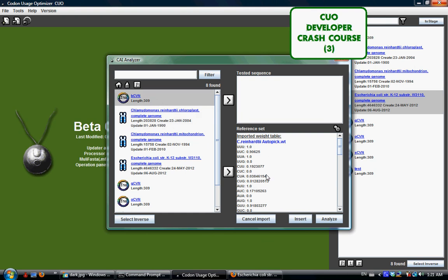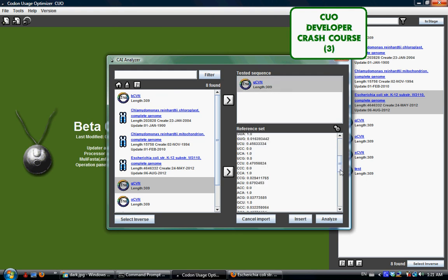This is particularly useful for diagnosing a target sequence in a host, creating some graphics to identify the preference of the target sequence in the host. But this is just a rapid analysis, and you can achieve more in the Optimizer actually. So I don't prefer to do it this way, but in case you want to, you can always do it.